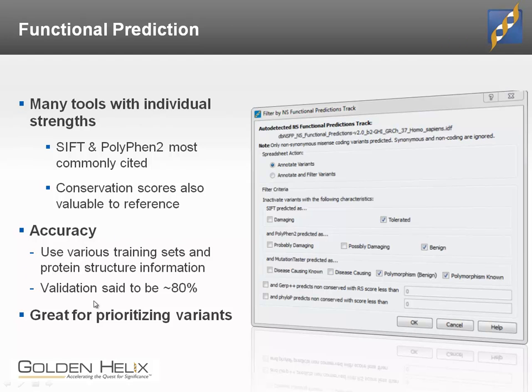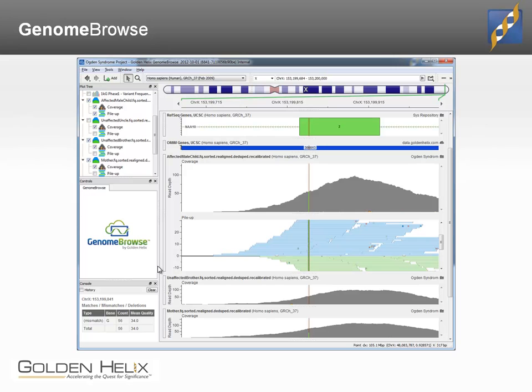In fact, I think there's been a number of studies showing that if you sample these and do a deep level functional validation, only about 80% of the predictions are accurate. Again, that's a pretty good number for something so complex. It's great for annotating variants. It's great for prioritizing which ones you're going to go and do some functional validation on, but you might not want to use this as a primary filter if it potentially would throw out some false positives at you.